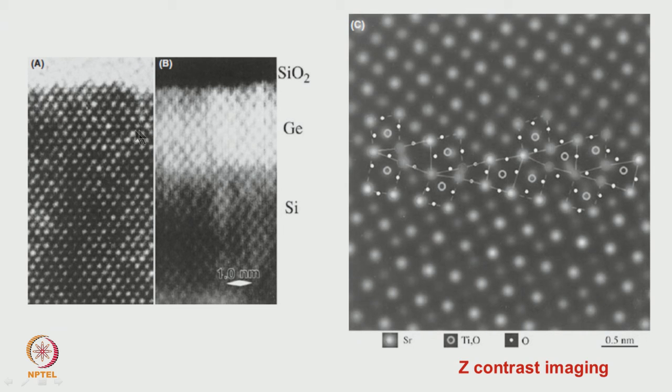And from the same region we are now doing scanning transmission, that is Z contrast microscopy. Since the beam size is made as fine as possible, of the order of the atomic size, an atomic resolution image of the sample can be obtained. That is one thing we should understand, and this is also from a strontium titanate. Earlier we studied that essentially we use the phase contrast to get atomic resolution pictures.